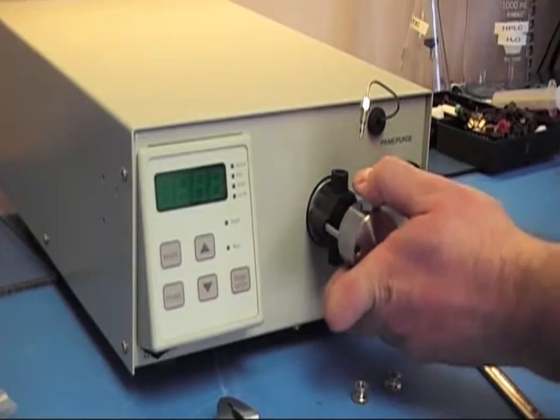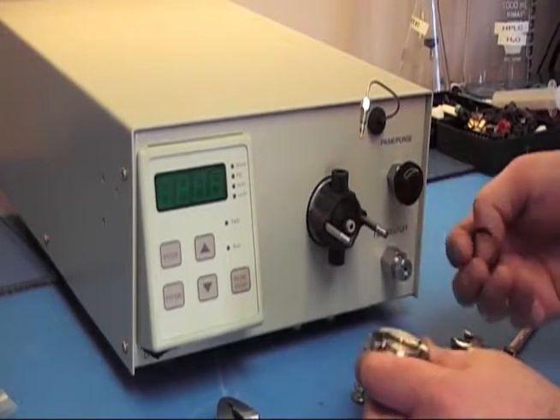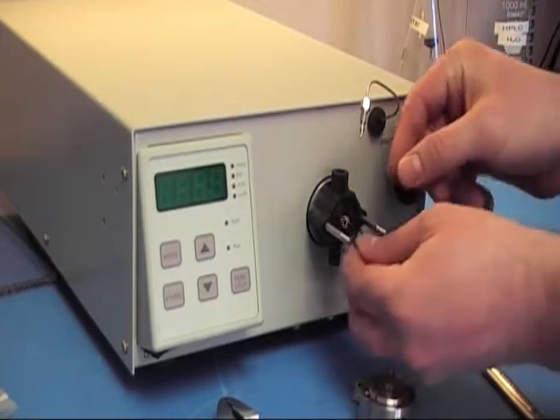After that, you can grab the head and just pull it off. If any of the gaskets or backup washers come off with it, go ahead and slide them back on just so you can keep track of them.